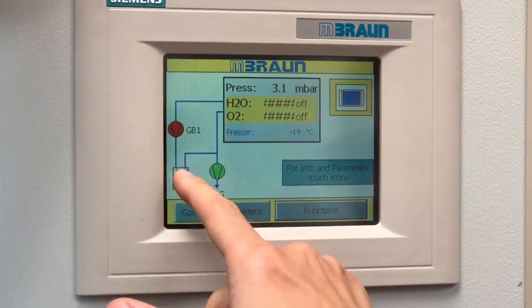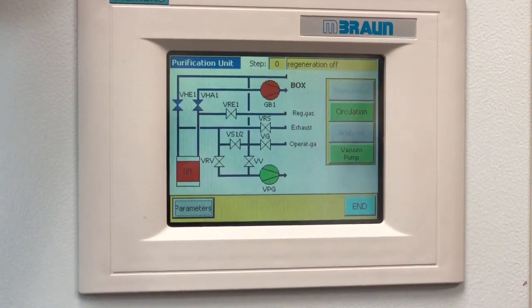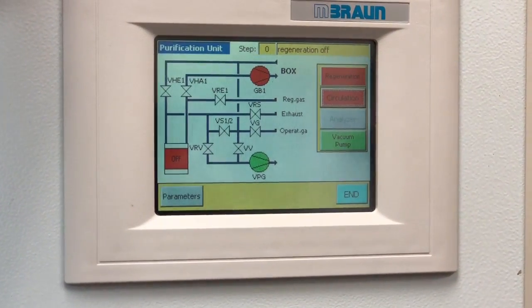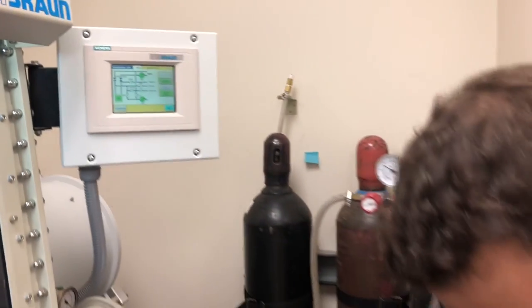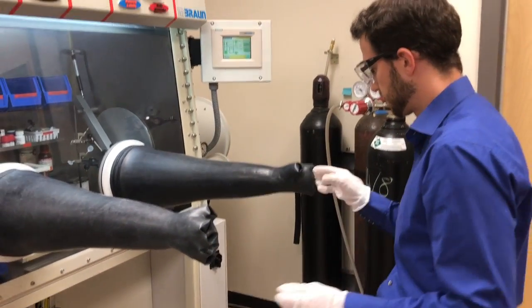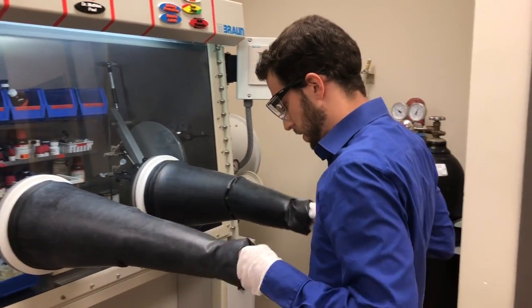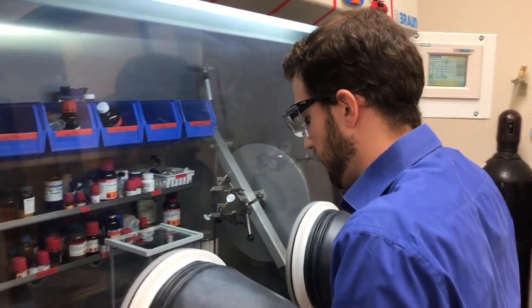If you press in this general area, you can see that circulation is turned off. Very importantly, if this ever happens to you, turn it on again. But if you go in slowly and press the pedal, it should be no problem.